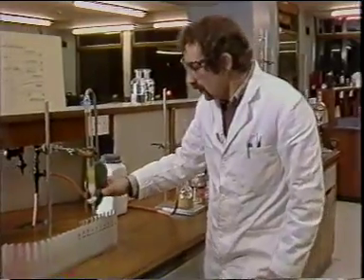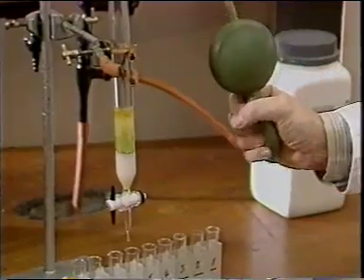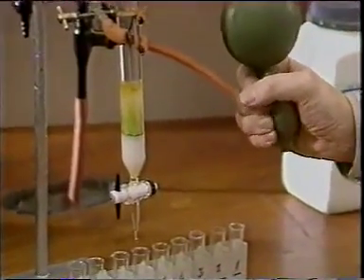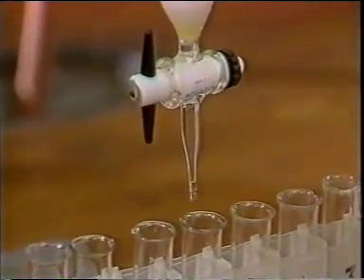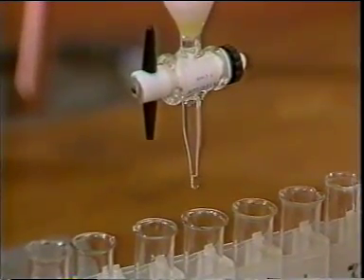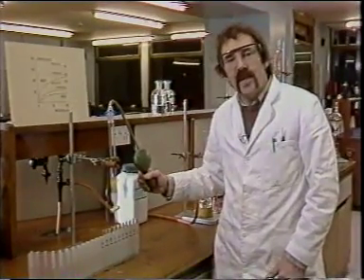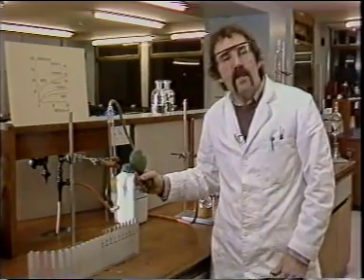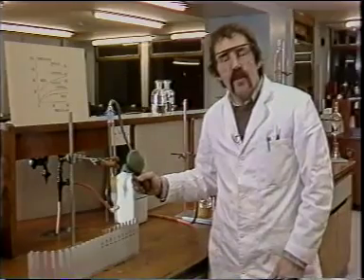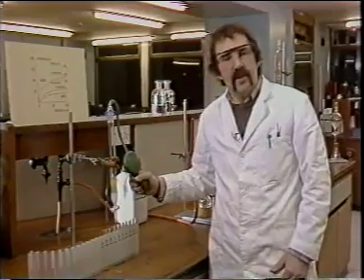Alternatively, we can use a pump system, such as we have here. The reason we need to use suction or pumping is because the absorbent we use in these flash chromatography columns is of much finer particle size than that we would normally use for column chromatography, and its particle size is also very uniform.